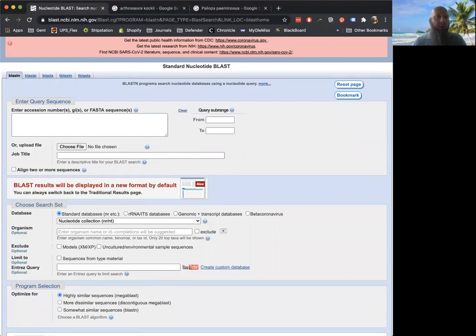Okay. And so let me pull up that sequence data real quickly. Okay, that is not it. Thought I had it quickly. There we go.